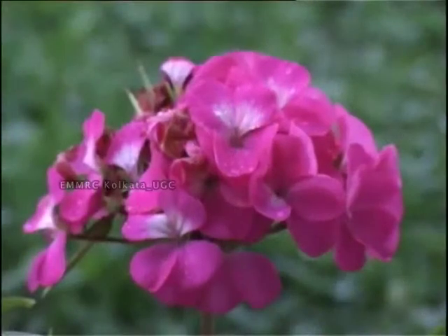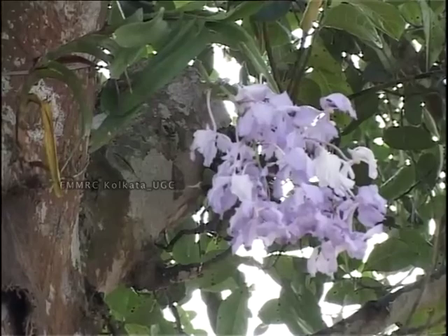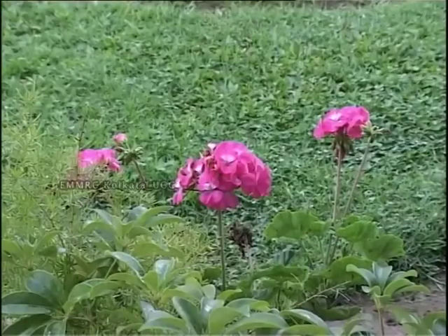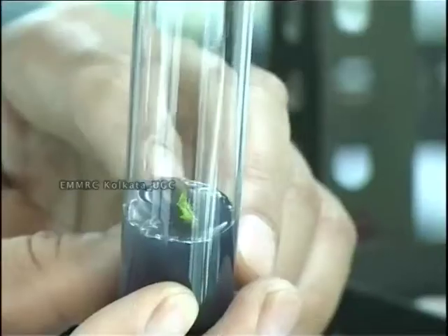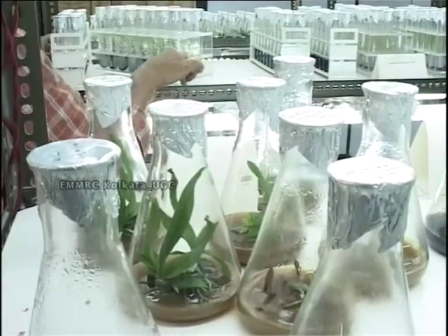Did you ever have a plant that was so unique or so exquisite that you wished you had hundreds or thousands of them to enjoy or to sell? Plant tissue culture is a technique which will do just that for you.